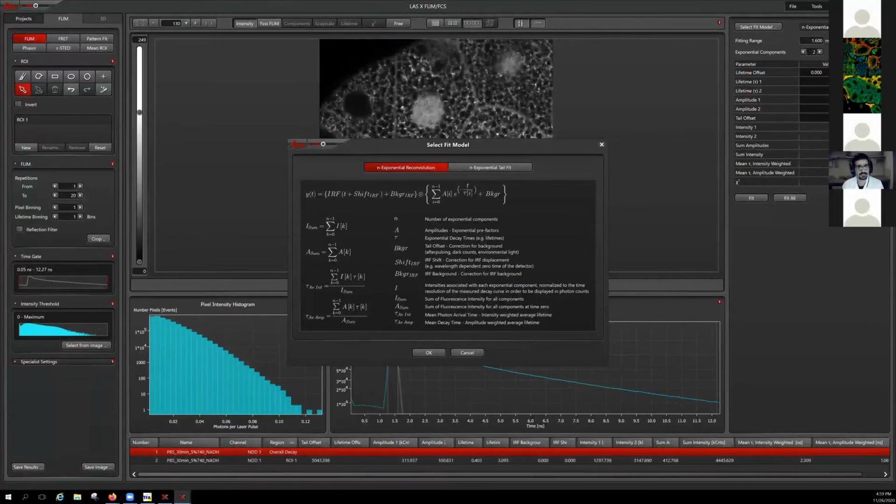So with respect to the other measured data that we have, what exactly is happening to that information, I really don't know. Maybe a person from Leica can jump in, or somebody who has already experience with this multiple time gating. That would be interesting to talk about.